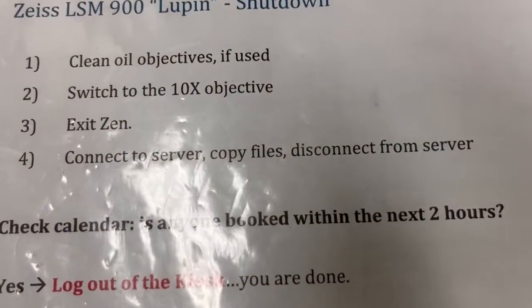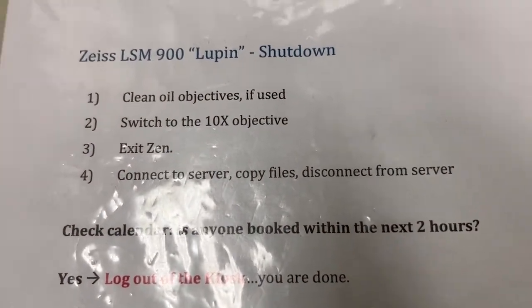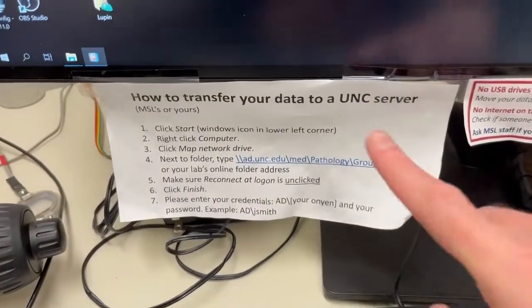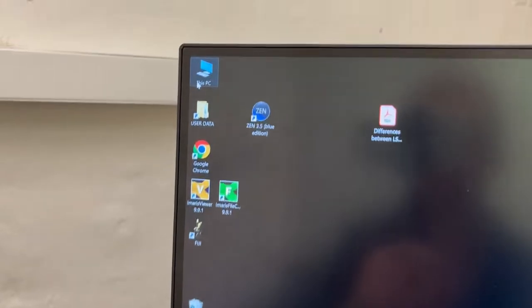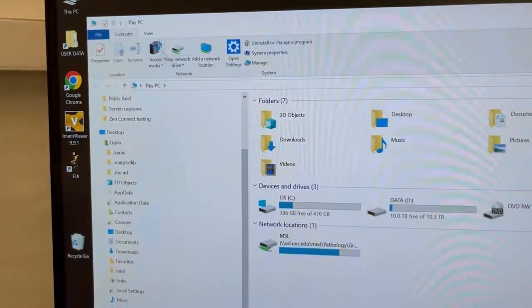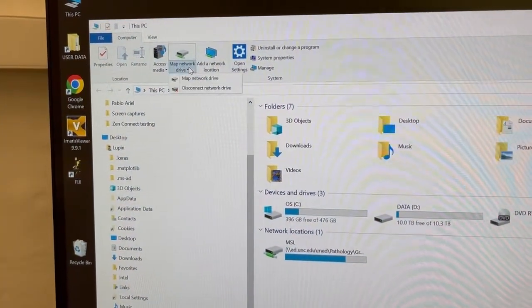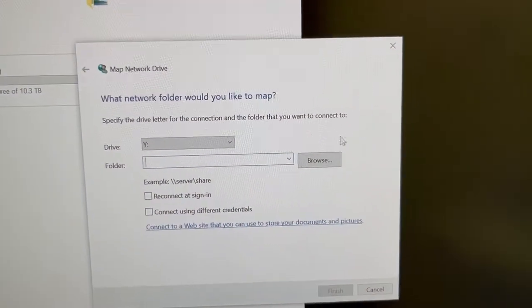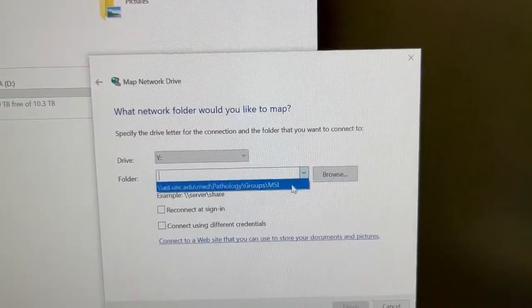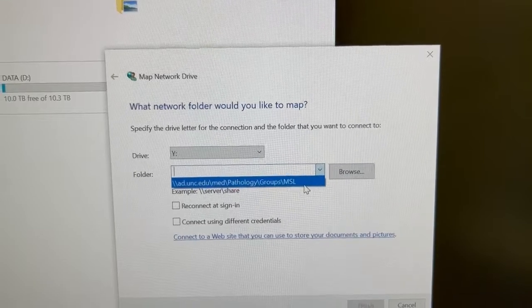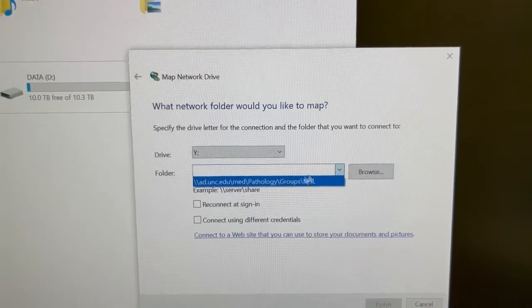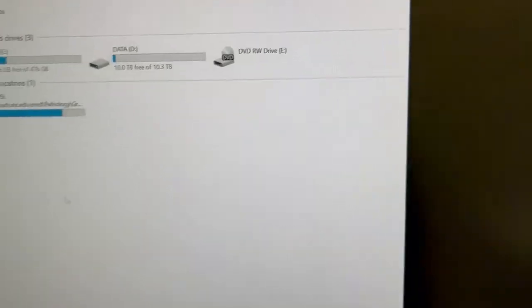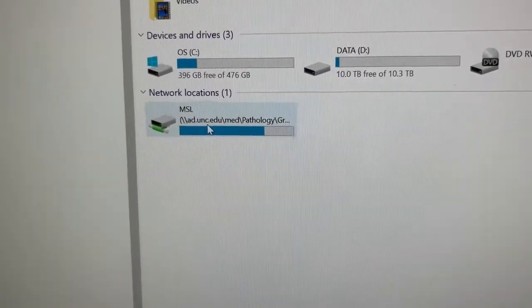The next step is to connect to server, copy the files, and disconnect from the server. So you do that as described here by going to this PC. This is slightly different but it's the same idea. You go to map network drive, you select the server that you want which can be our server or your lab server, you'll need to get the address. I've already done that so this is what our server looks like.